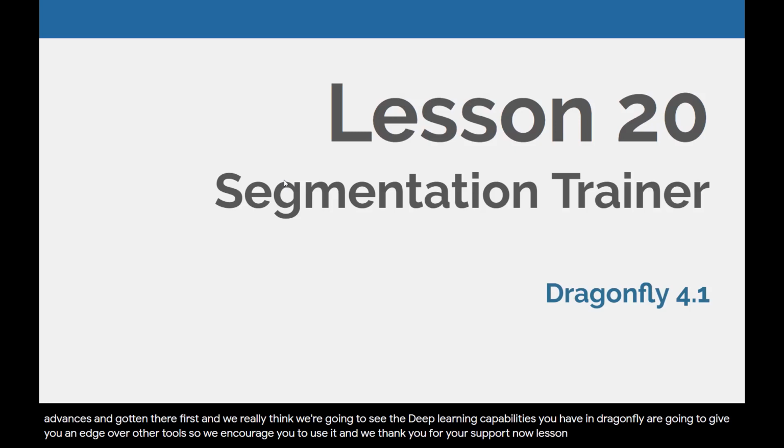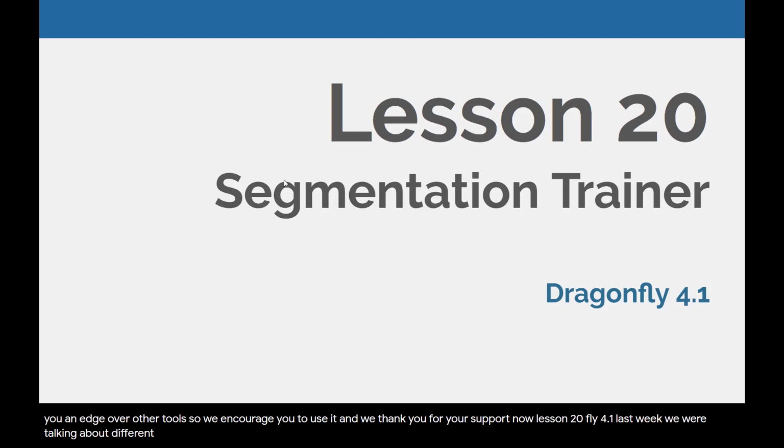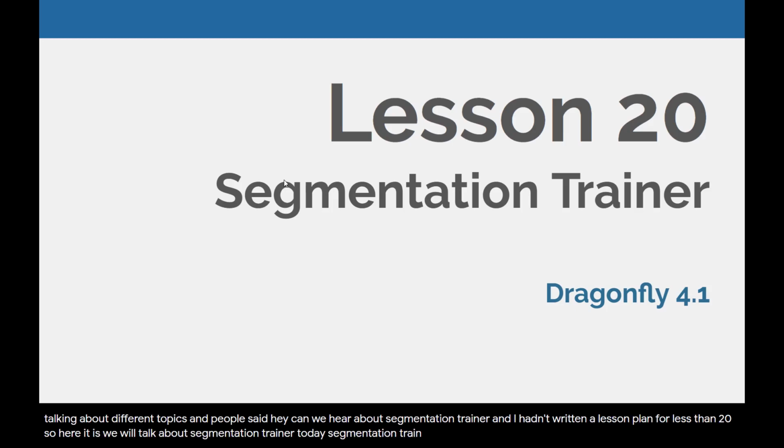Now, Lesson 20, Segmentation Trainer. Today's lesson will be carried out in Dragonfly 4.1. Last week, we were talking about different topics, and people said, hey, can we hear about Segmentation Trainer? And I hadn't written a lesson plan for lesson 20, so here it is. We will talk about Segmentation Trainer today. Segmentation Trainer is a tool.